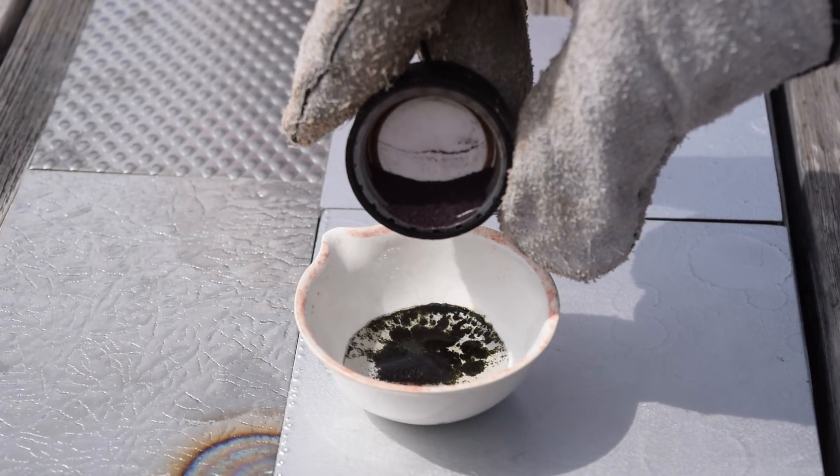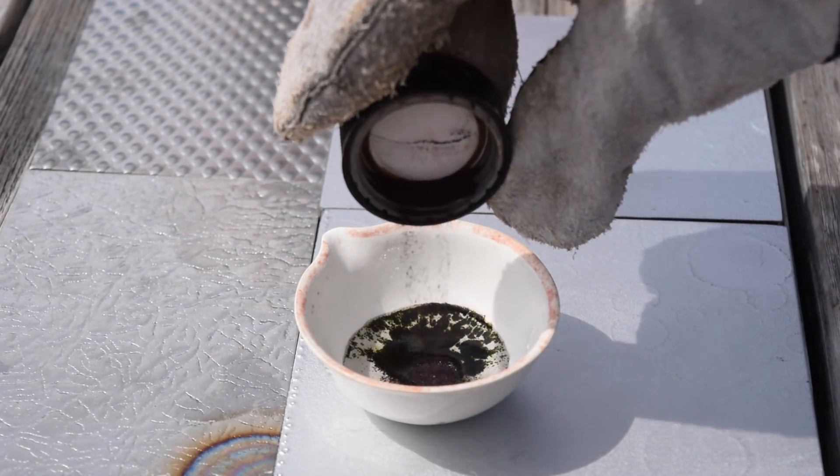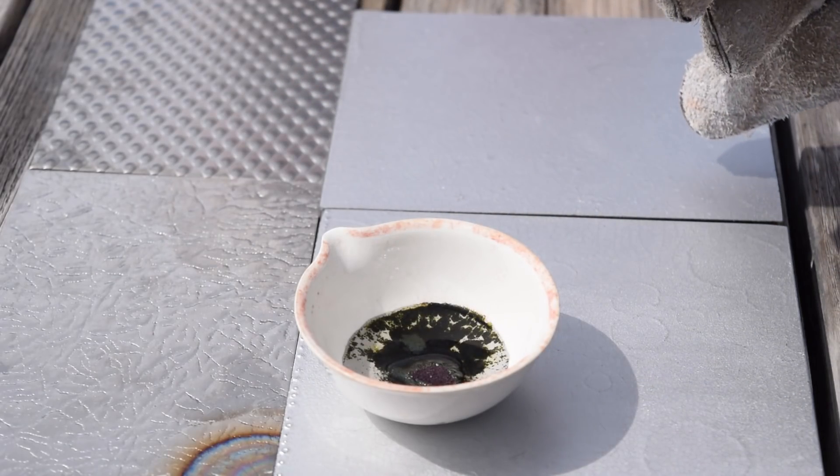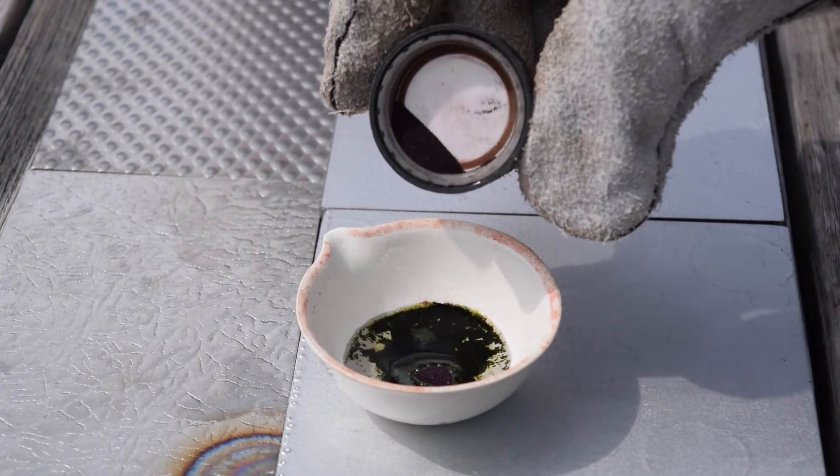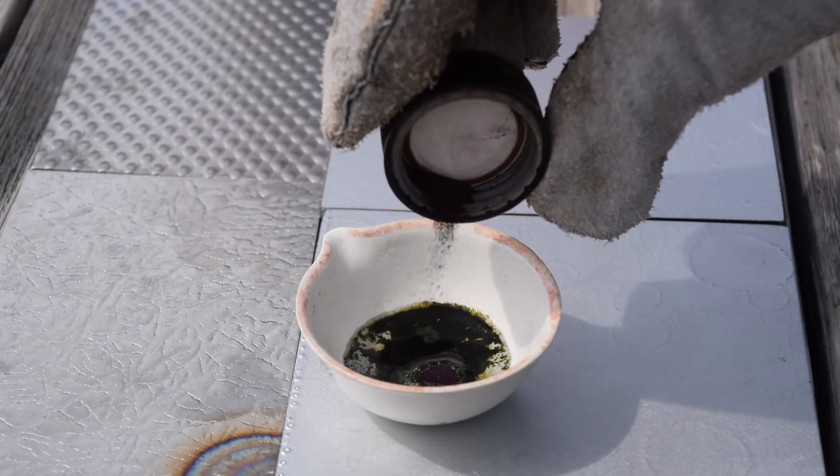That just reminded me I need to find something to stir this with. Just a little more permanganate — you can see that nice green color. I don't know how well you can see that on the camera, but it's definitely apparent to me. That should be good; we'll find something to mix that up with and get right to mixing stuff.